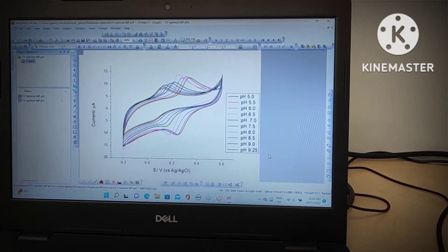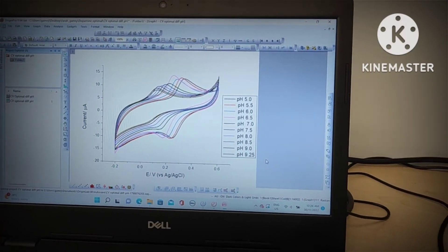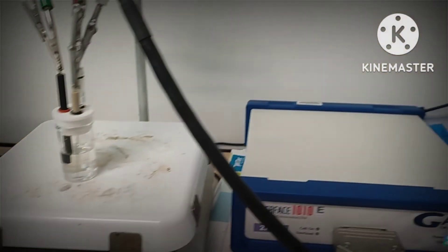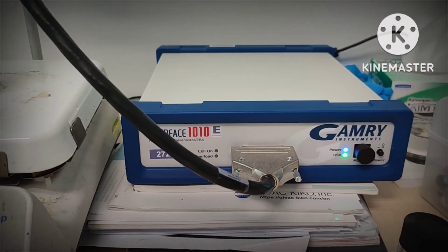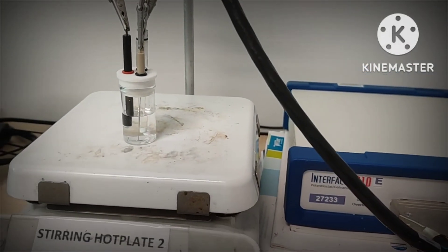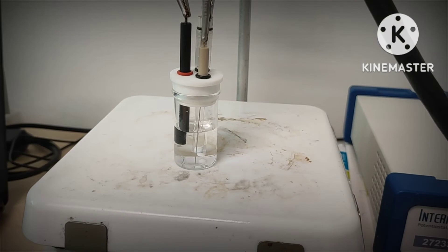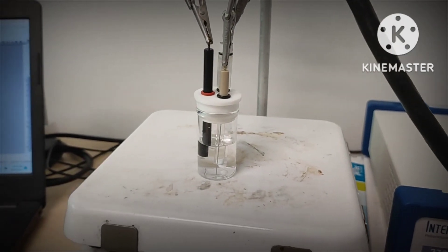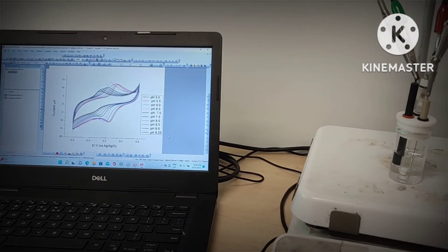You can see from the pH study that basically GAMRI can do the same compared with Versastat and also Autolab. If you like sensor work, you might be familiar with this one. That's all, thank you.